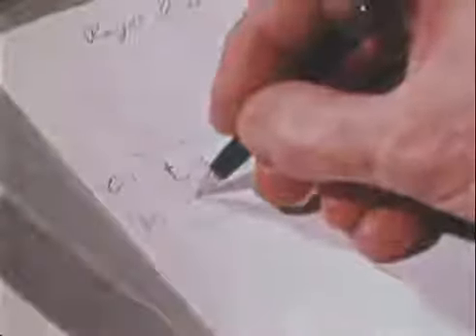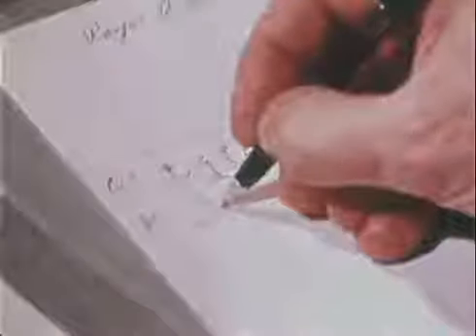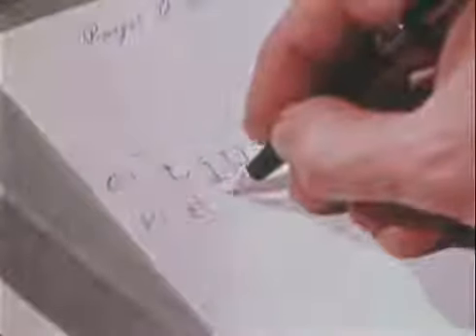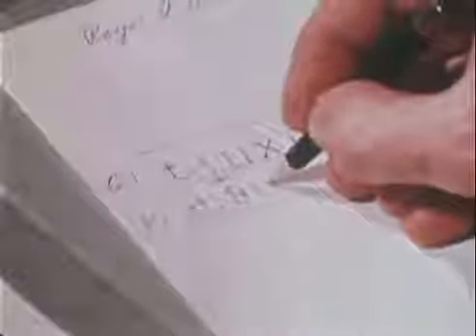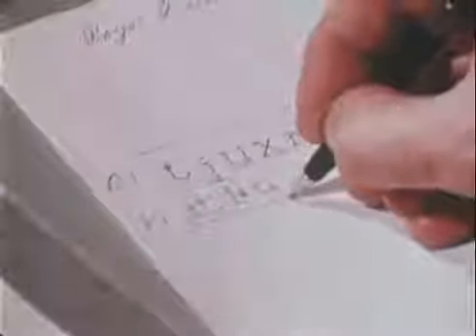The T of the questioned note repeatedly prints above the line. This is not so in the known copy, and he marks it dissimilar. One I also strikes above the line, but this may be due to shift key in motion. The upper left-hand serif of one U is broken. On the other note, this character shows no damage. He marks the dissimilarity.